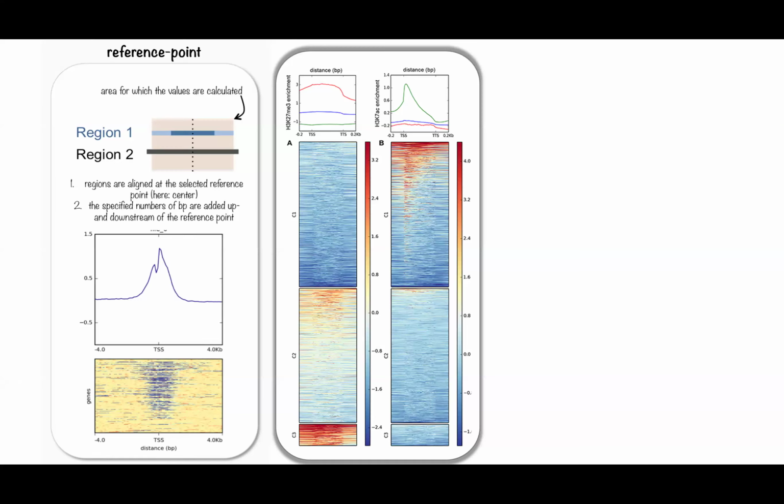So the key part is you're giving it those bigwig files, and you're giving it the regions that you want to look into. This you can't really do in the whole genome, you need to have some regions defined, particularly because it's going to try to align those. But you could make those your own. I have done this before where we tried to identify enhancers from data and then plot on those enhancers. So even if they're regions you discovered from the data set itself, you can still use them for plotting.